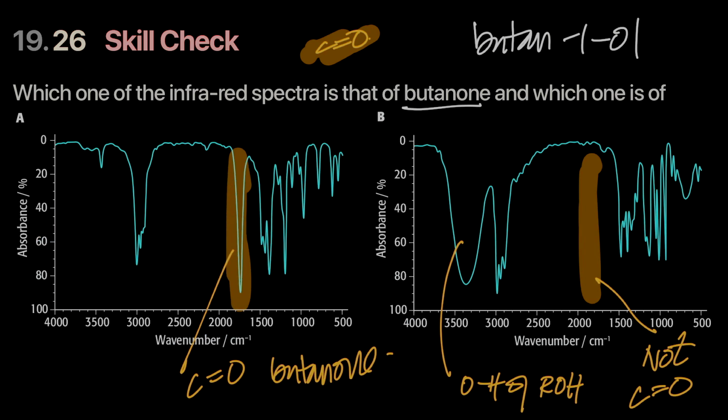So sometimes you can identify what the peaks present, and also identify what is not present by looking at the peaks. All right. So I'm going to wrap up this half here.